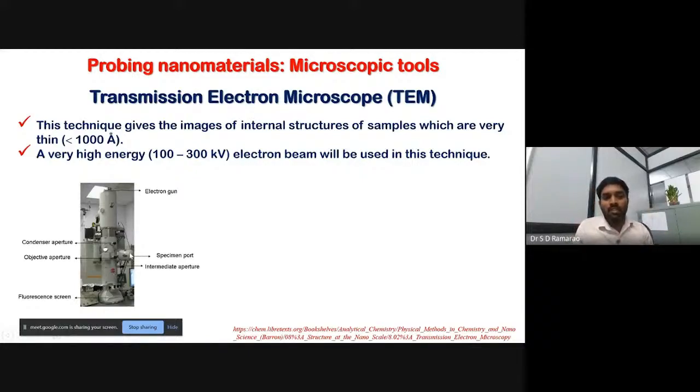And you can see here you have a small microscope and a fluorescent screen, so on that you can see what is happening when the electrons are falling on it. That means you can do imaging and electron diffraction in parallel. So we'll see how the results will look.